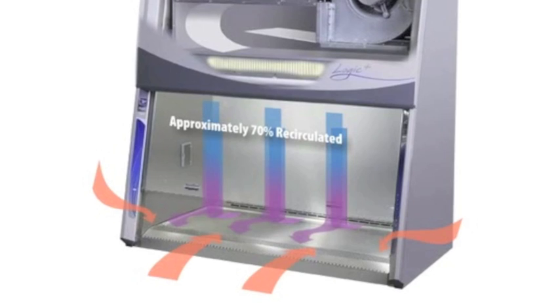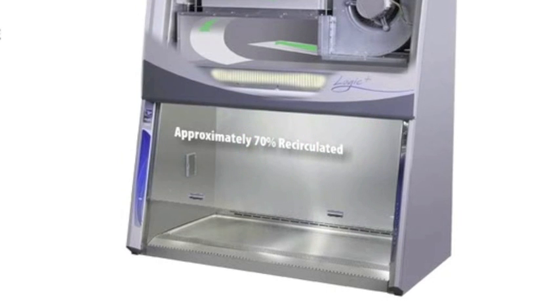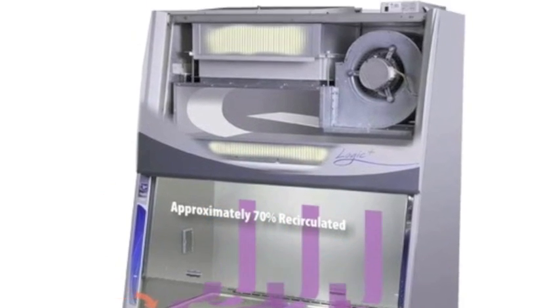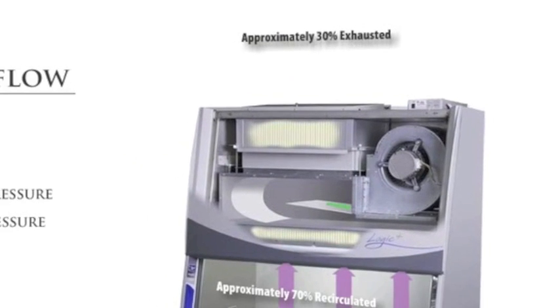This contaminated air is drawn by the blower through the back plenum of the cabinet, where approximately 70% of the air is recirculated through the supply HEPA filter and back over the work area. The balance of the contaminated air passes through the exhaust HEPA filter to be safely discharged into the room environment.